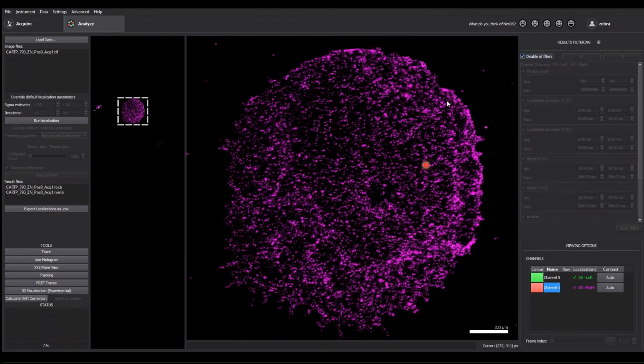But what this whole video sequence showed you was that this kind of acquisition can take place, for instance, to get to this picture in about 5 minutes. And we have many workflows that work on throughput and so forth. But the workflow that I'd like to show you next is how you can take the raw data from here and put that into our analysis pipeline.